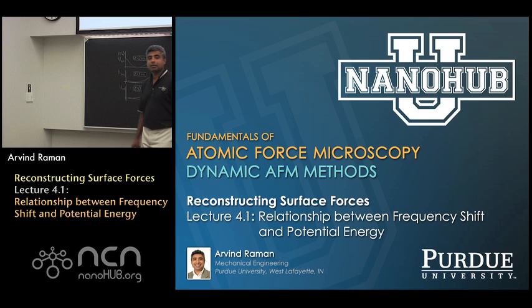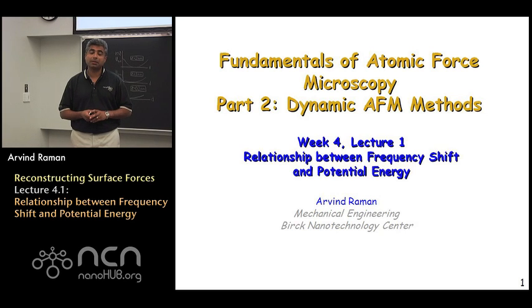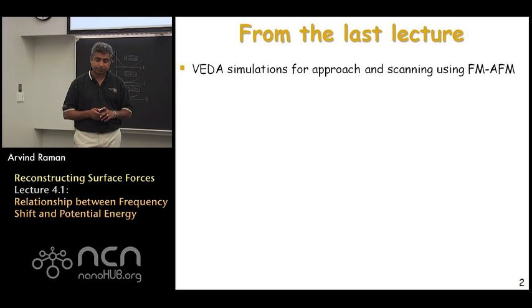nanoHUB-U, online instruction. Hi, and welcome to week 4, lecture 1, dynamic atomic force microscopy methods. In the last lecture, we were talking about VEDA simulations, a virtual environment for dynamic AFM, and we went through a lot of background on how you might be able to use it for simulating a lot of realistic situations, both for spectroscopy, where you approach the sample, as well as for scanning tools, and that you could use it both for frequency modulation as well as amplitude modulation methods of operation.